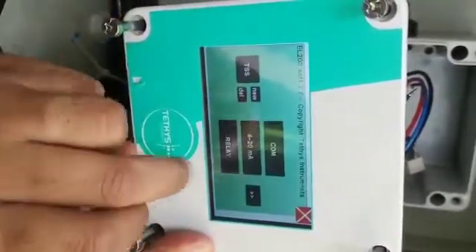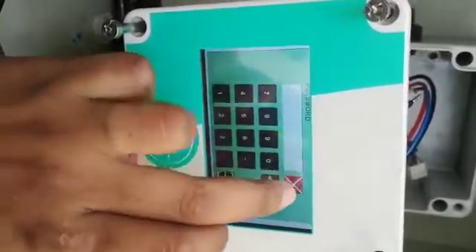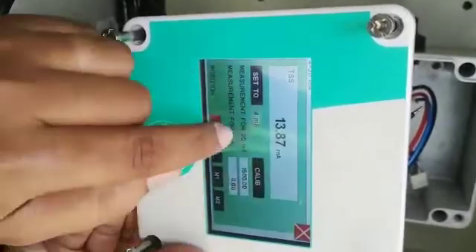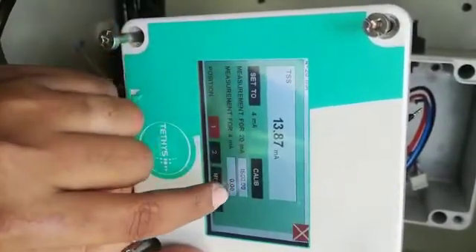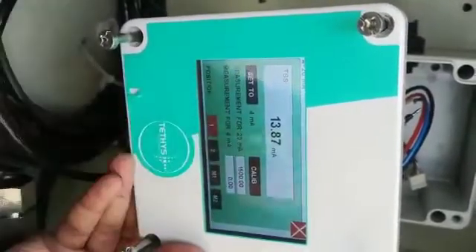After that, set the 4-20mA range. No password is required. We have set 1500 for 20mA and 0 for 4mA.